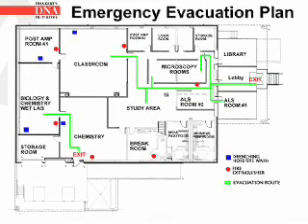This is an example of an emergency evacuation plan. Notice the green lines are showing how you can reach the exit quickly from every room in the laboratory, and also where the drenching hose and eye wash stations are and where the fire extinguishers are.